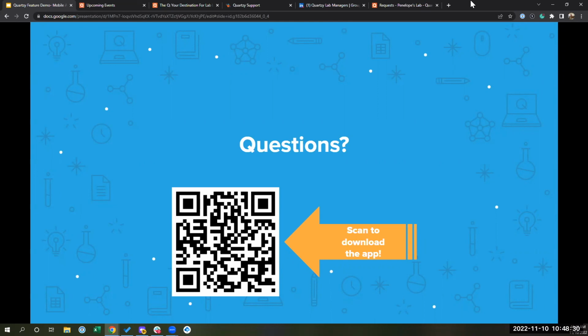I believe that, well, Chris, I'll let you weigh in on this one as well. Sorry to throw you in here so much, but I believe that we're looking into that. It's a great question. I think you could solve this today with what Libby was talking about, where you could have a dedicated field, like the custom barcode field. You could put it in technical details or something like that. If you have a manufacturer's barcode, you can put that somewhere on the inventory item or on the request, and then you can scan it to receive it or request it or update it.